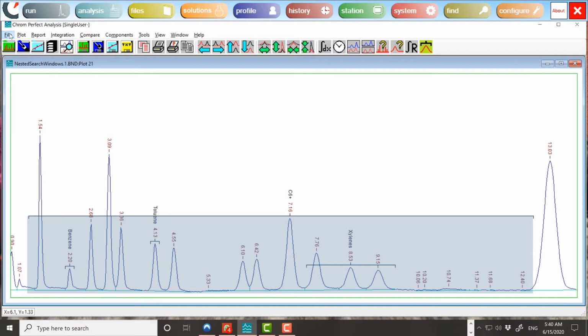If this was the end of the story, then this calculation could be performed with a multi-peak window. But the same region also contains peaks due to aromatic components. These must not contribute to the C6+ fraction, instead they must be reported individually, using their own response factors. Although it has always been technically possible to perform such calculations in formatted reports, it has not always been easy to do so. The necessary formulas require knowledge of component numbers, so the format files work only with specific calibration files. Furthermore, not all situations have solutions. If the small window is adversely located relative to the large window, then peak identification does not always work as expected. These problems have been addressed in a coherent fashion.